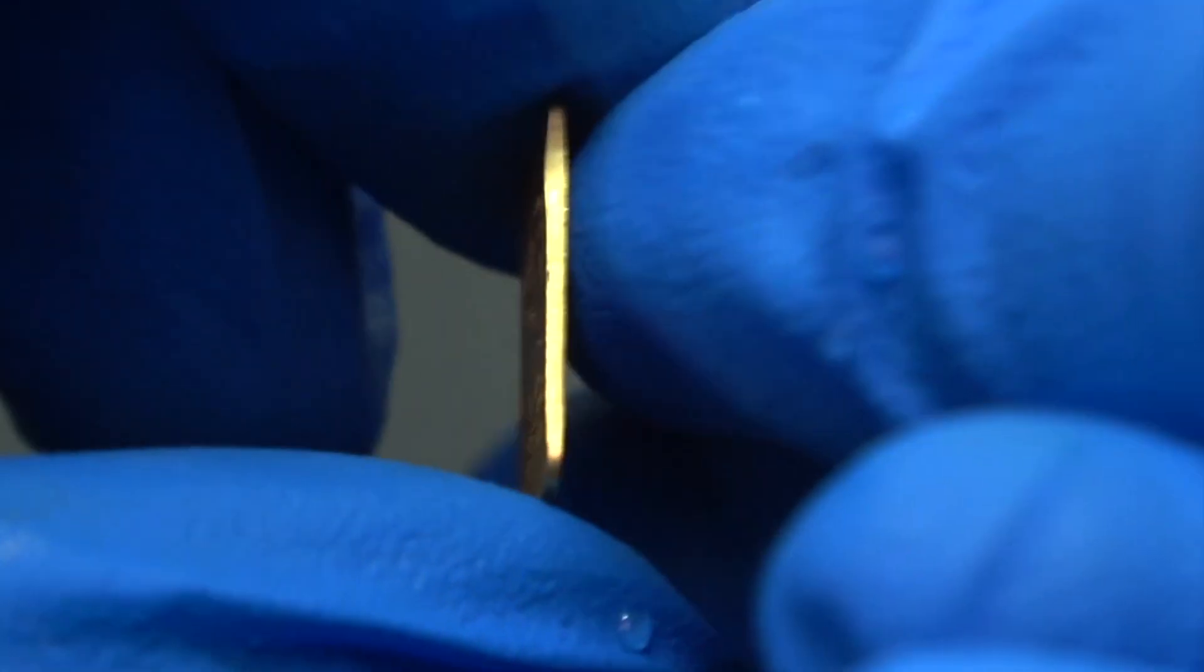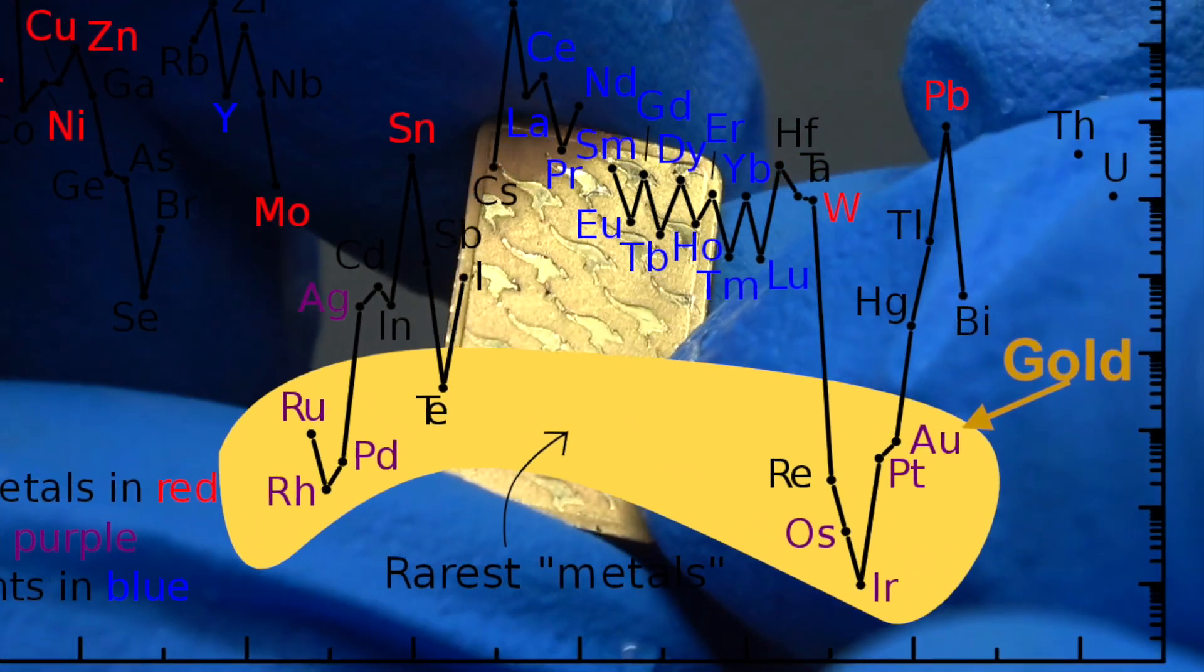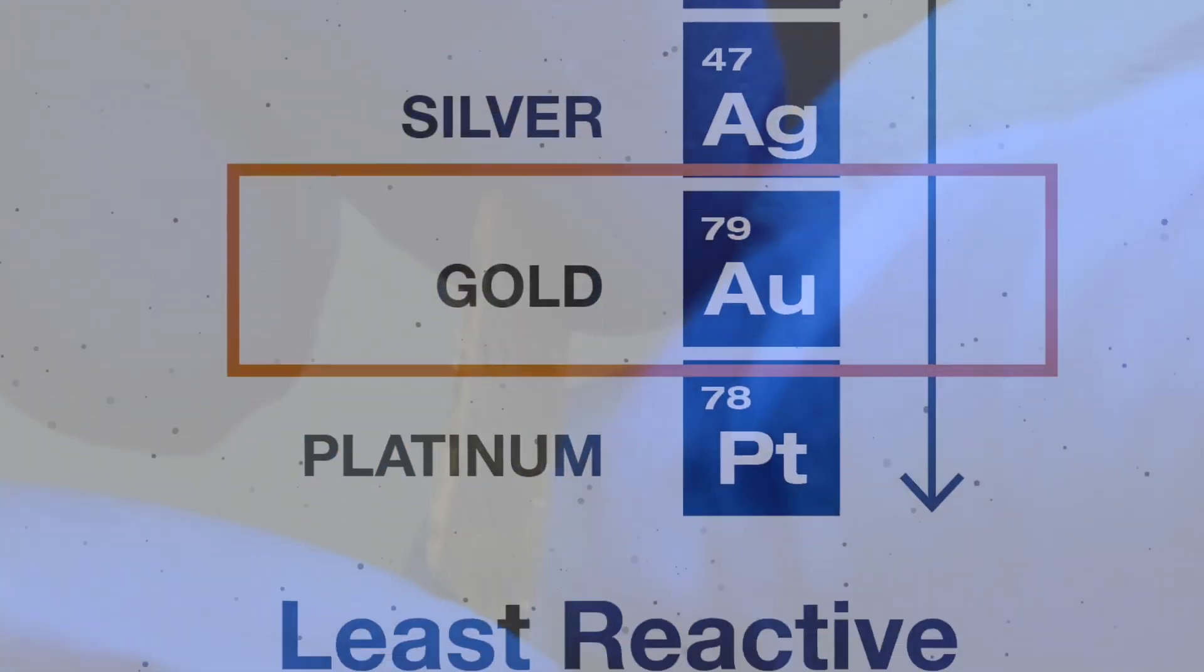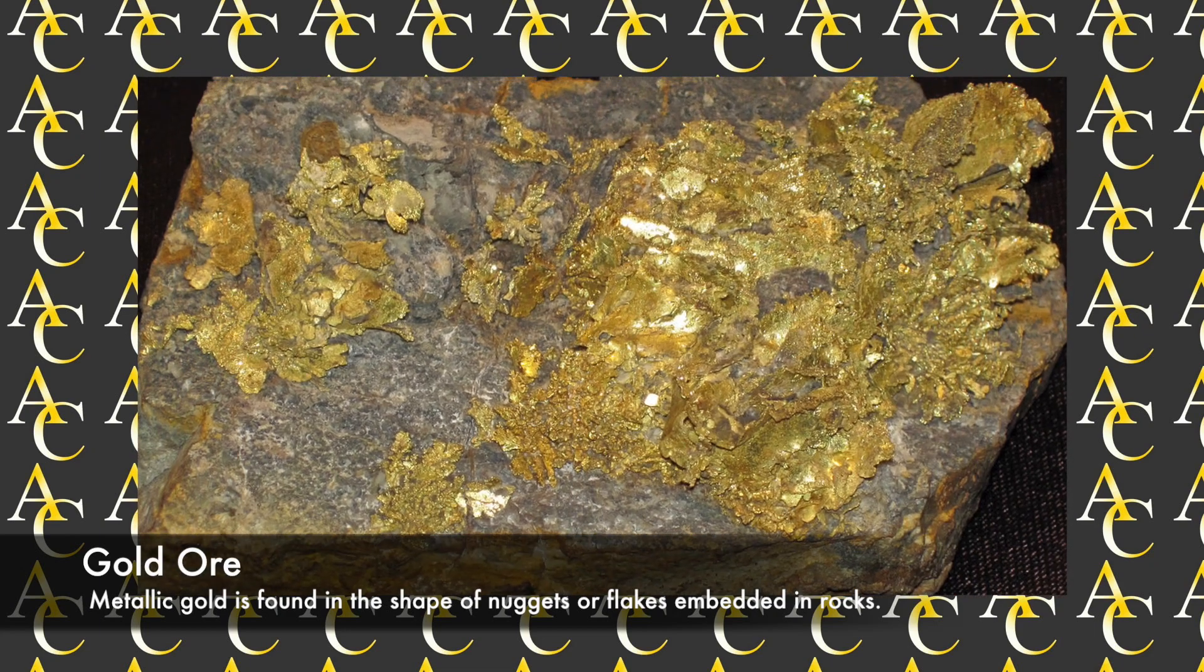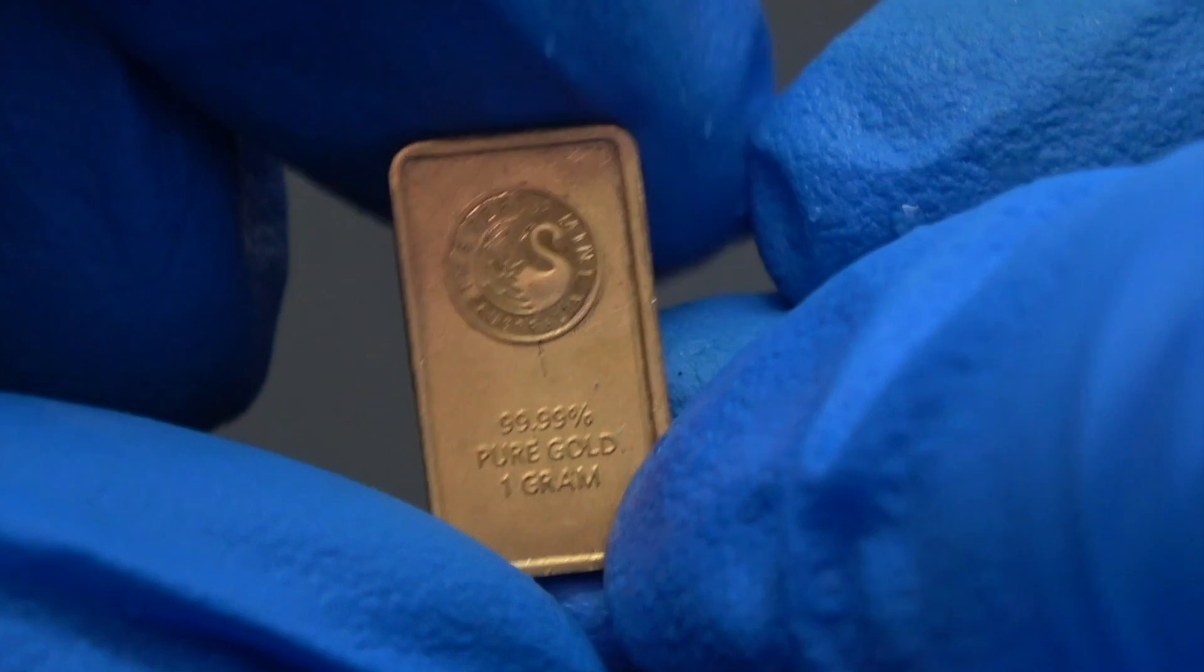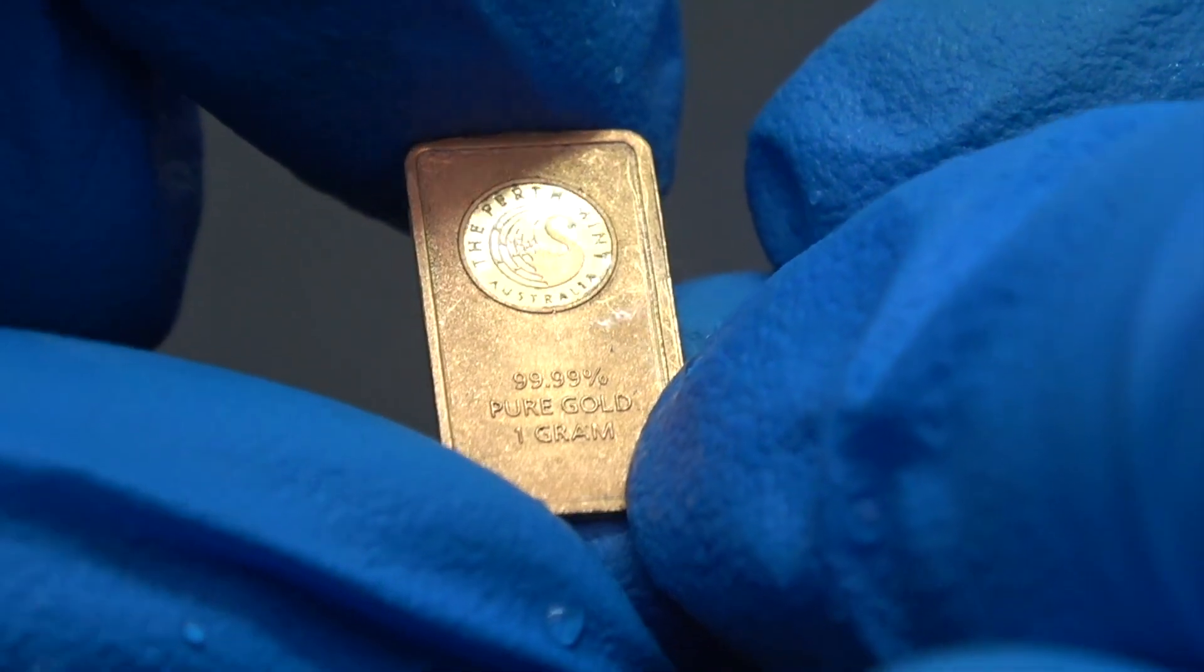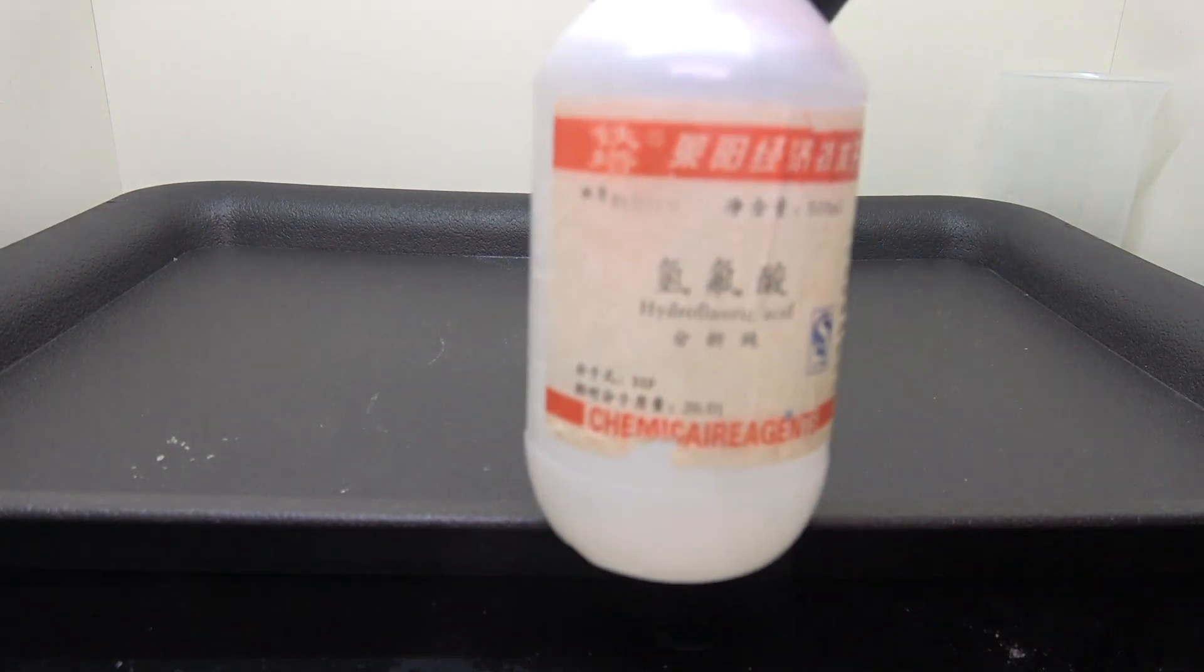Gold has been considered a precious metal since the dawn of human civilization, not only because of its rareness but also its immunity to almost all chemical attacks. It's one of the very few metals that remained in its elemental form since the formation of this planet, and it will stay the same way long after humanity falls. But will it survive 40% hydrofluoric acid, the only mineral acid that can dissolve glass?